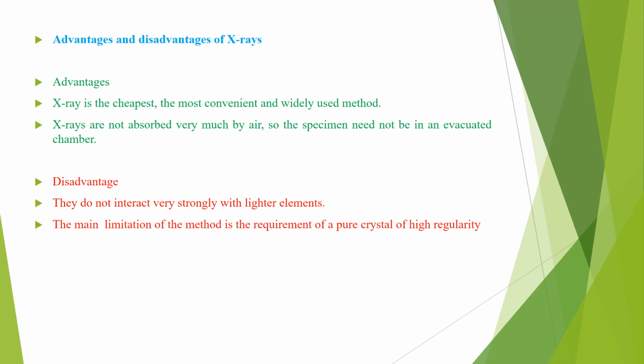So this is the other disadvantage, that the method requires a pure crystal of high regularity if we use X-rays as a source to determine the single crystal structure.